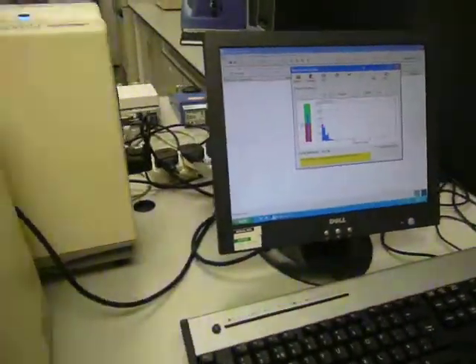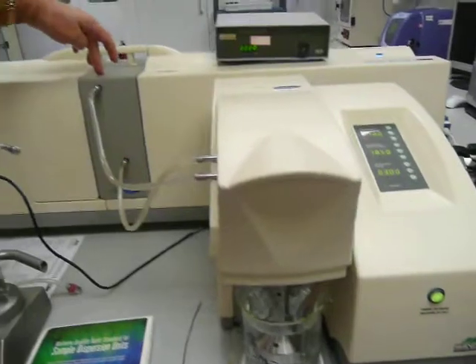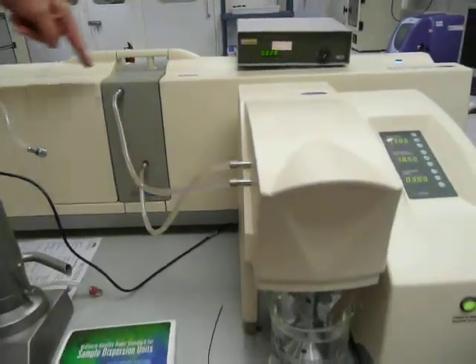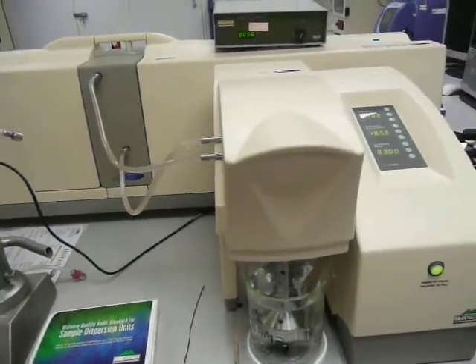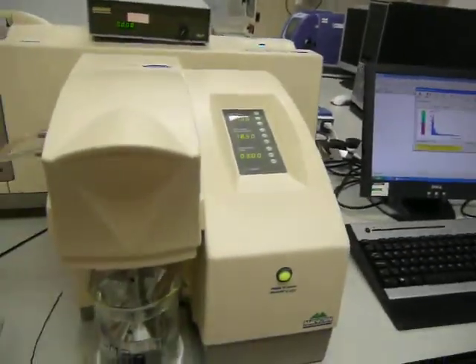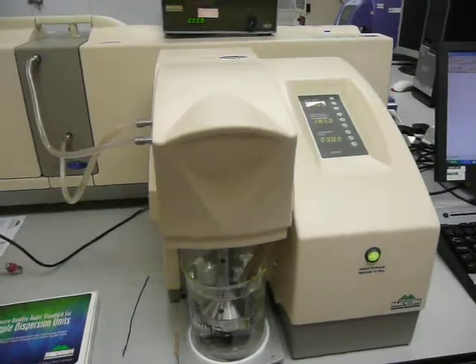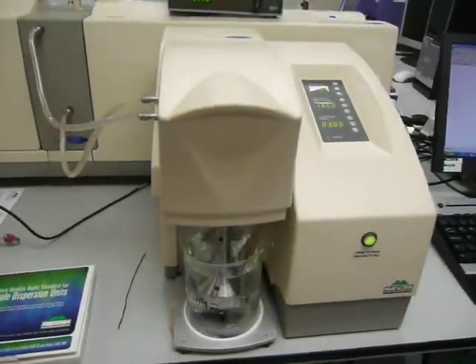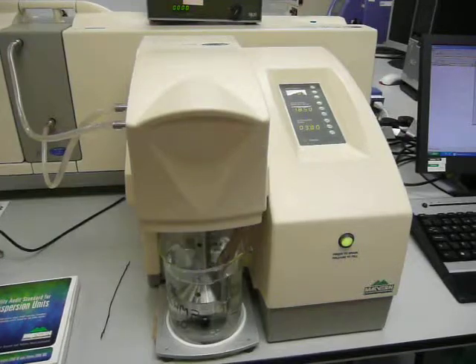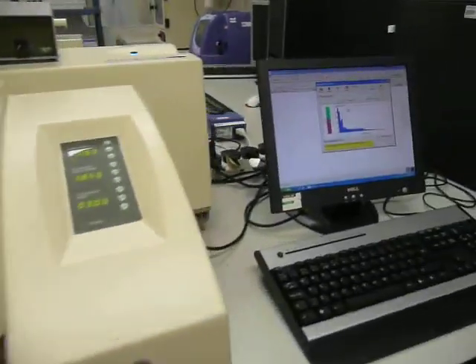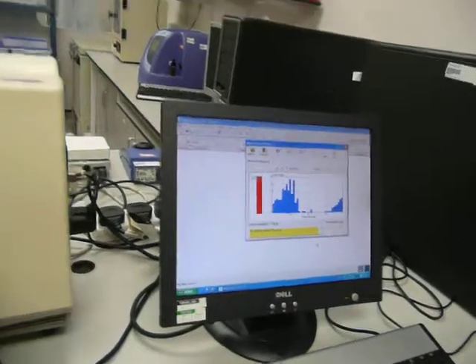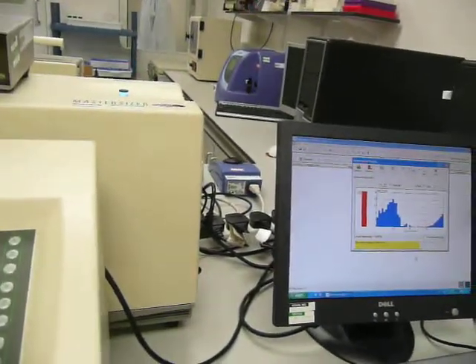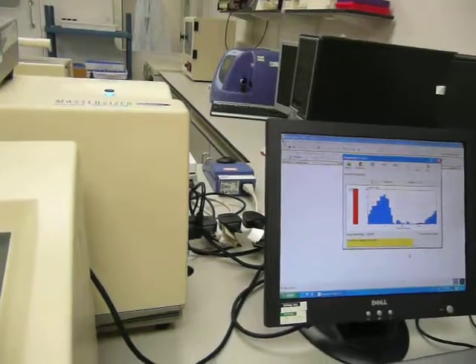What it's doing is flushing the liquid through the cell, and there's a laser that is trying to line up on it. There are probably some bubbles which will make it look a bit odd. But we do this from here, just through the cell. Do you hear that click? That's the shutter opening, the laser beam passing through the trans.